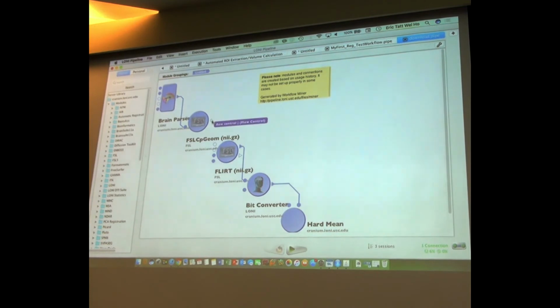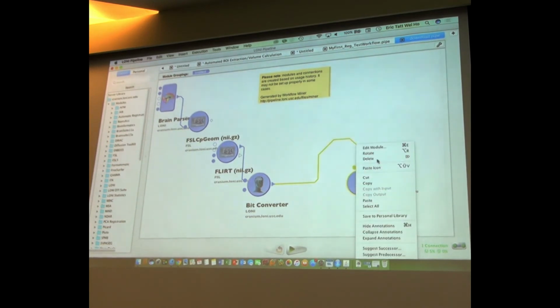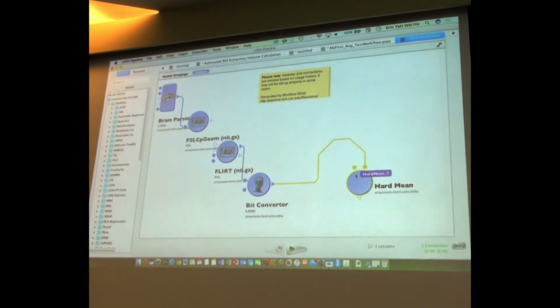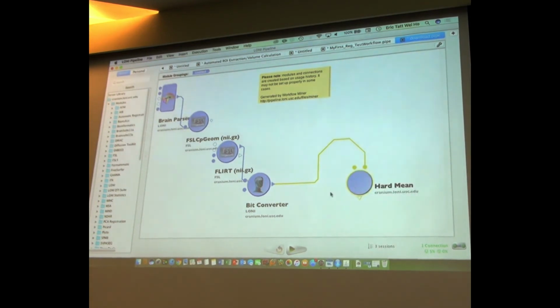Look at this. There is a flow of control that hangs in there. It's not linked to anything. There are a few missing parameters. So these are things that you may want to consider including in a workflow that has to do with, in this case, I think it was segmentation. You know, if you're going to be doing segmentation, some of these modules may be appropriate for you.